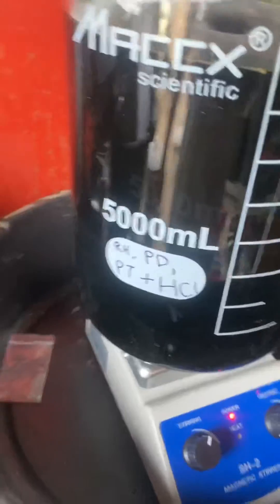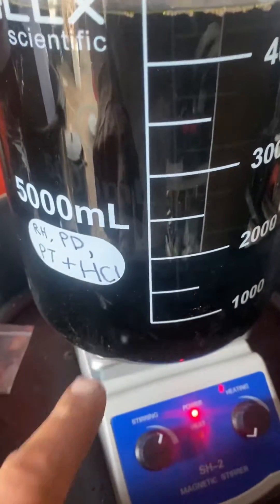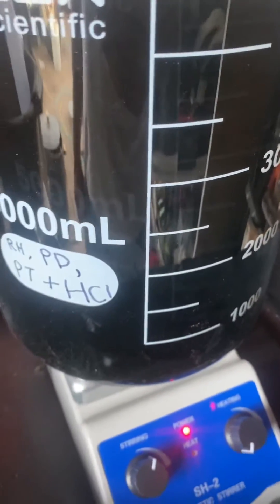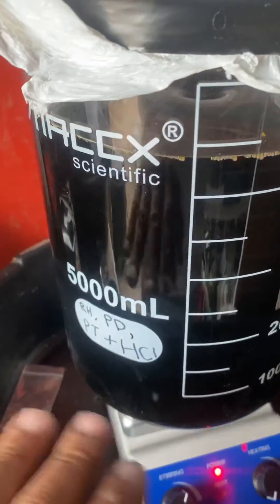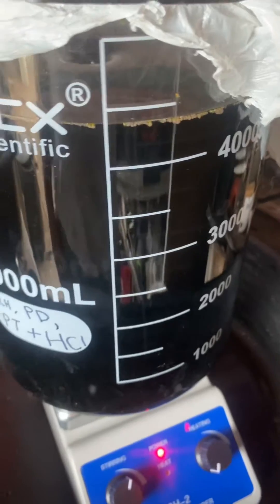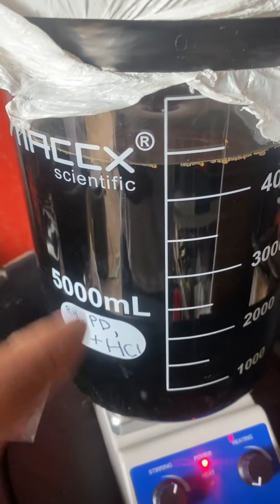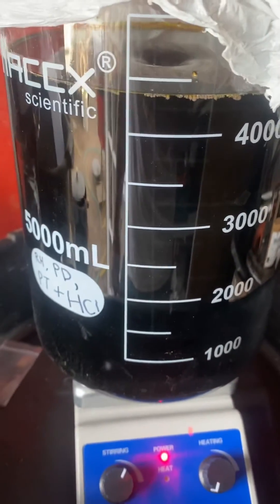Once we have that, we'll siphon all of this out and be left with just the salt powder at the bottom. It should be really dark — a dark powder. Then we'll filter that out, and I'll use some copper sulfate to dissolve the copper out of our substrate, and we'll be left with pure platinum.